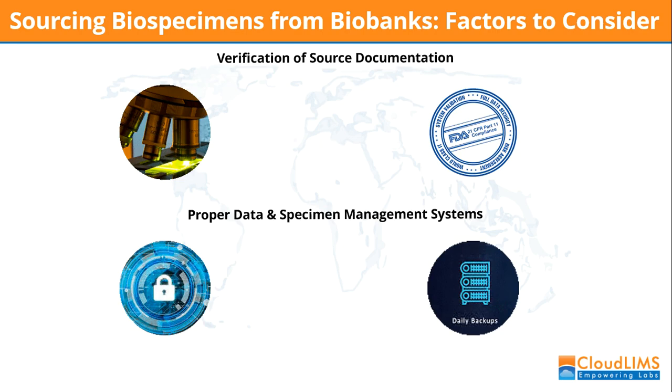Other important factors to consider are whether a source of data is available that gives information on any clinical findings relating to the tissue, information on the surgery that took place, or any other observations required for clinical research that could provide an explanation for any experimental results derived from these tissue specimens. Additionally, proper sample management systems should be employed. Now, these will ensure the accuracy and reliability of testing and therefore can give confidence in clinical research outputs.